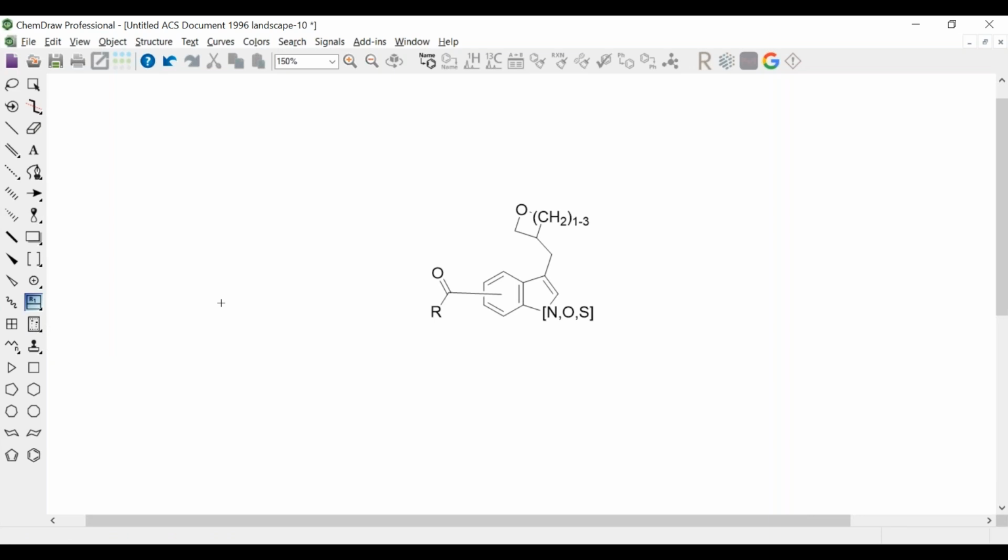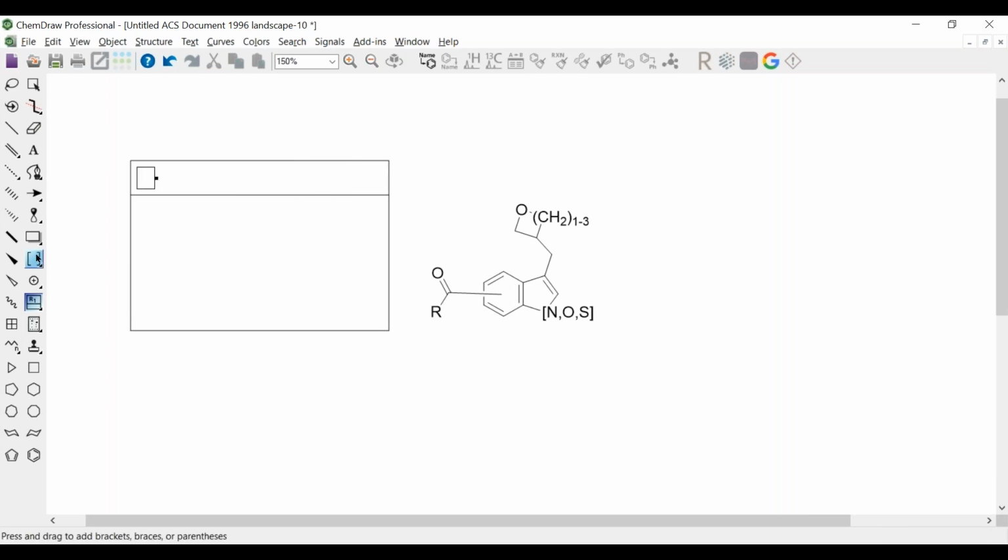You have to have ChemDraw Professional or Signals ChemDraw, but then select, draw that table R, and then get into here and start drawing the substituents. Now the key here is the attachment point here. I hit the period key over that, and that's how that defined that is the connecting point here, that's what's going to go there. And then it's just a matter of copying these structures and then moving the substituents around so that you get individual compounds, right?